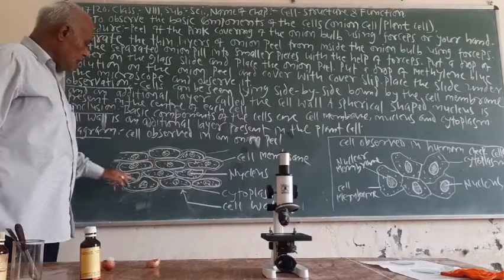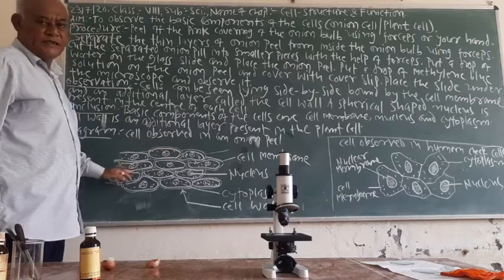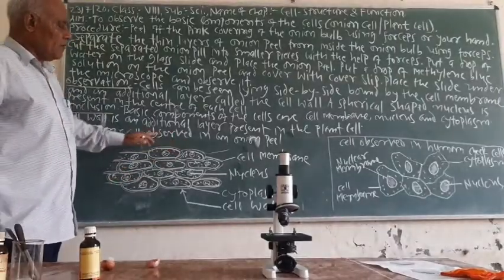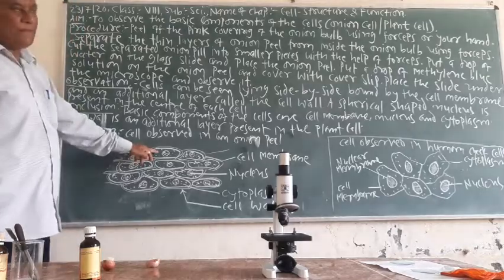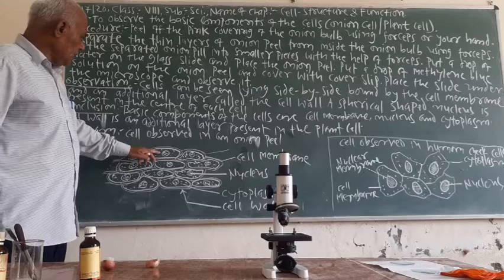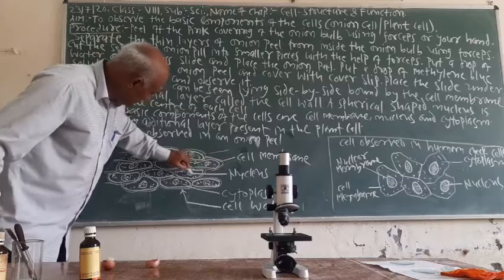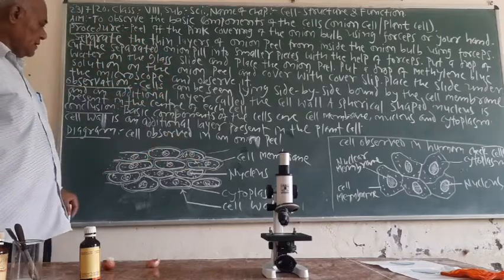And a spherical shaped nucleus is present in the center of each cell. This is a nucleus; these are the nuclei of each cell.